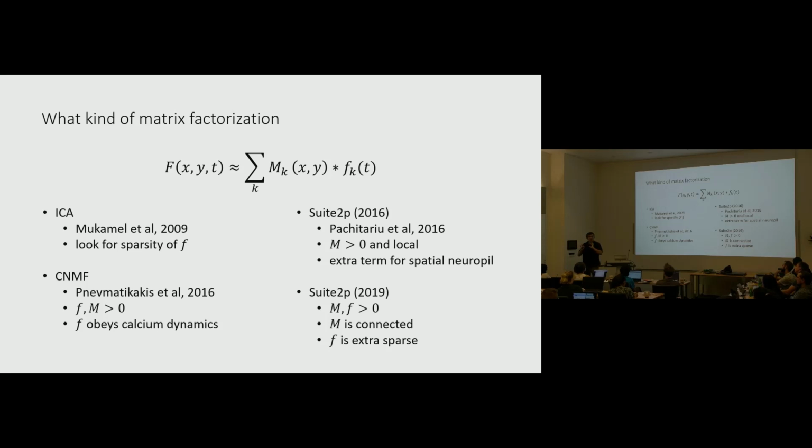Because maybe you don't need to know all the details about how we find these masks. As long as we give them to you and they look like cells, and they talk like cells, you're happy: okay, you gave me some cells. But now you really want to know how the fluorescence is extracted from those cells, because that's going to influence your analyses. And so we keep these two parts very separate, the part where we extract fluorescence and the part where we extract ROIs, which is not the case for this approach, for example, at least not by default. But of course, you can always take any one of these other methods and take the masks from them, and then do your normal extraction of fluorescence the way you normally do. In fact, that's what I recommend for any of these.